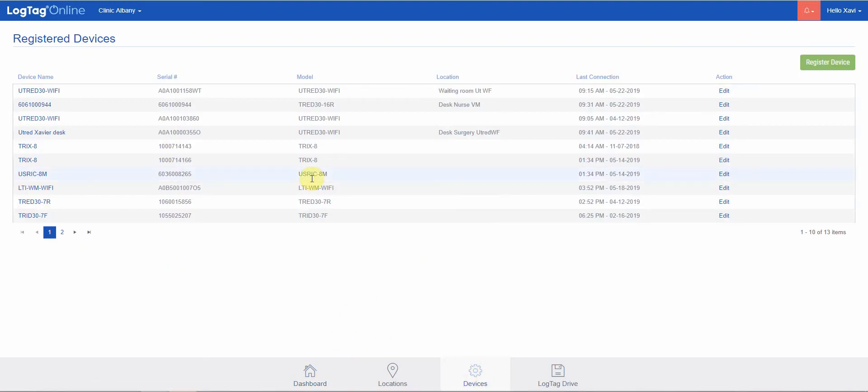The devices panel shows the list of registered devices or log tags, LogTag loggers associated with or attached to your account.